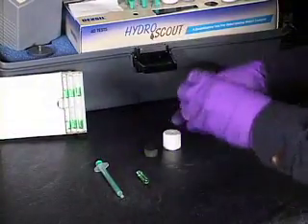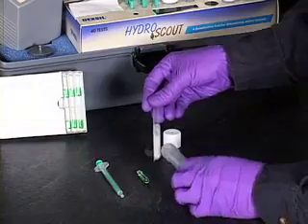Assembly: Remove the white cap, black septum, and plastic straw containing the reagent ampoule from the reaction tube.